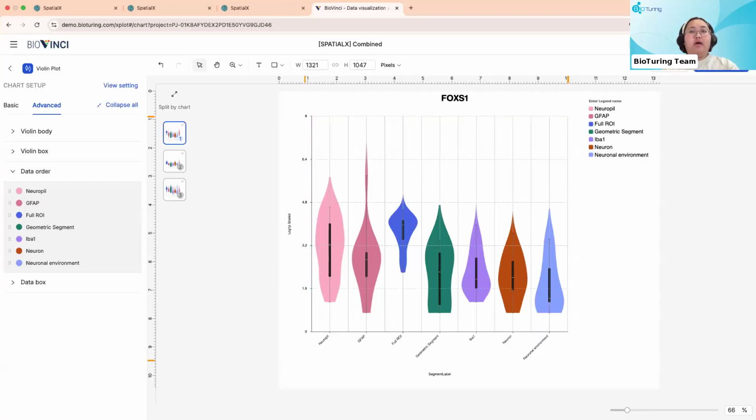Okay. Yes. And that's everything to sum up the presentation for GeoMx data today. So it's like a quick tutorial actually, ranging from data submission, pre-processing the data, processing the data, and also some types of downstream analysis that you can perform.